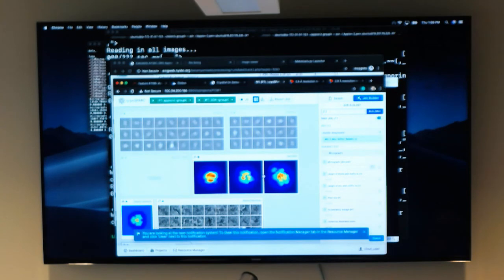Yeah. Really? Or you make your box smaller. It depends on particle size. Your pixel size would be larger. Then you would have to use CPUs at the end. It's an actual limit. That's what I was mentioning. It's a real limitation. So we've had to do that on our system.